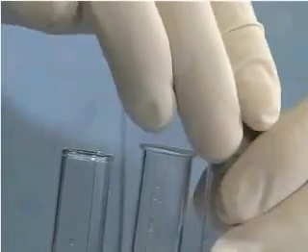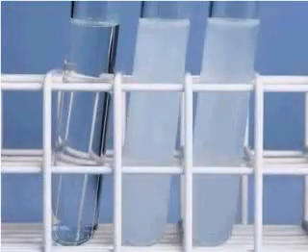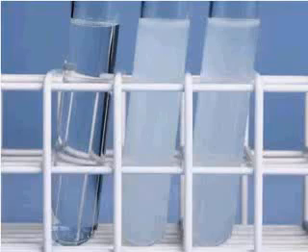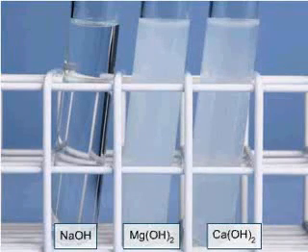We shake the test tubes vigorously. Magnesium and calcium hydroxides are partially soluble in water, while sodium hydroxide dissolves in water totally.